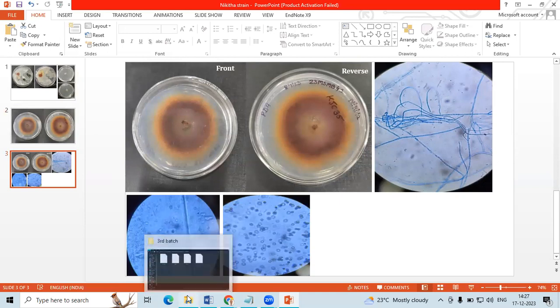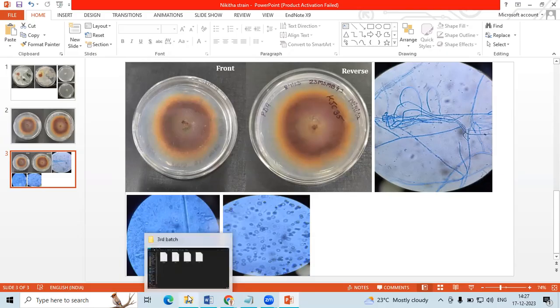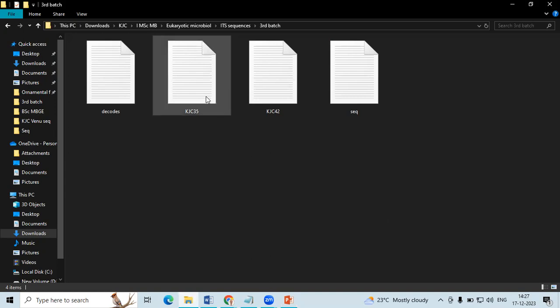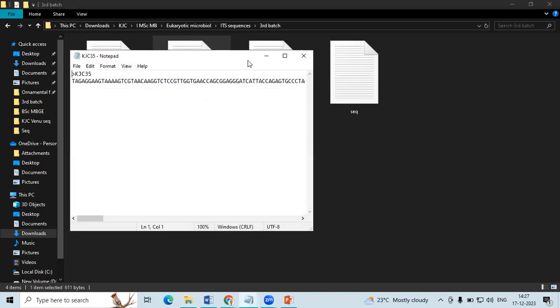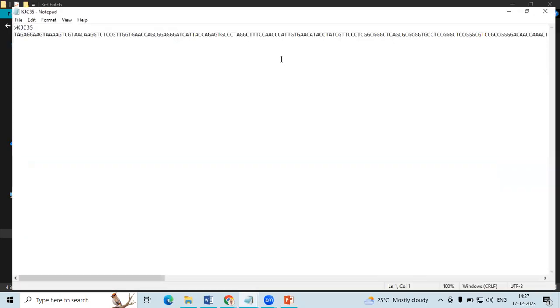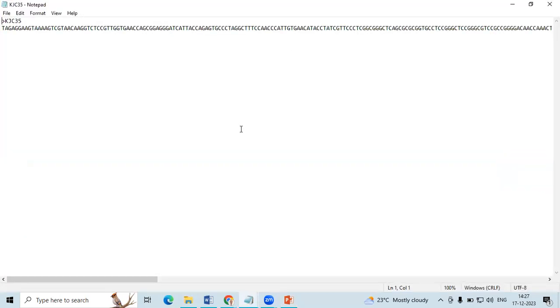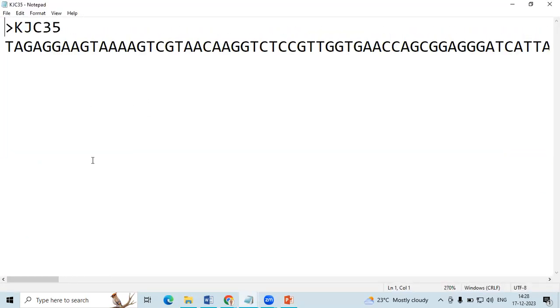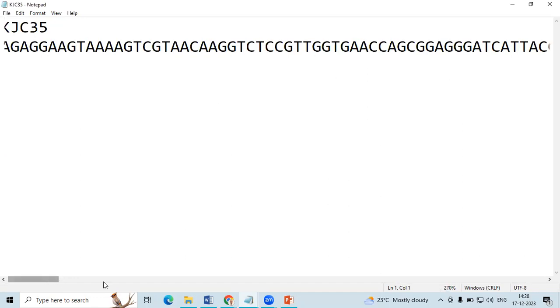So when the sequences come, usually the companies - we usually ask the companies to extract both forward and reverse, compile it, trim out the primer and give only the actual sequence. So typically, you will receive a sequence in FASTA format. So here is the sequence.